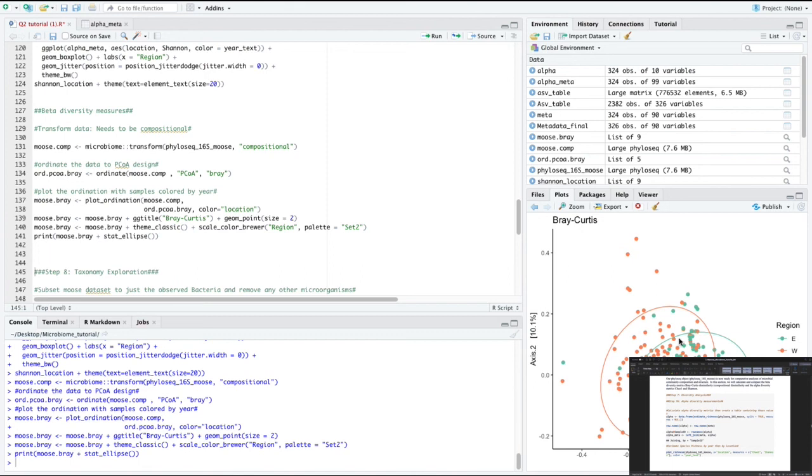because it seems like the pink are clustering together over here and the green clusters together over here, aside from, again, those few outliers. So when they cluster separately, like if the circles were right on top of each other, then you would say, no, you don't have two separate groups when you group them by location based on their bacteria. They look the same. What this is telling me is that the bacterial diversities in these two subpopulations, the moose on the east, the moose on the west, does differ. The overall compositions are differing from each one.